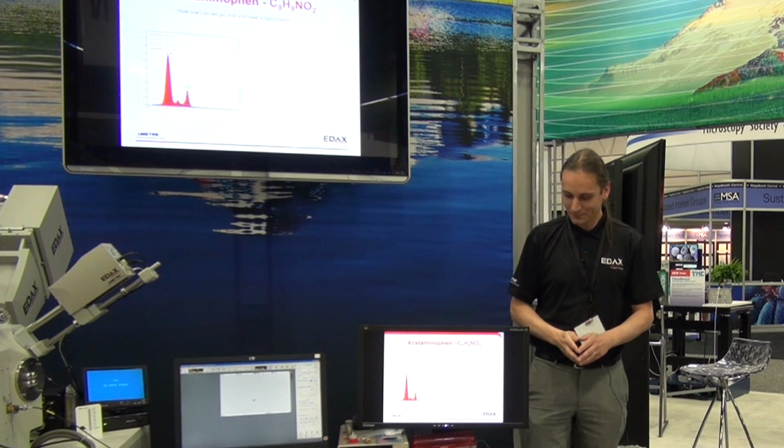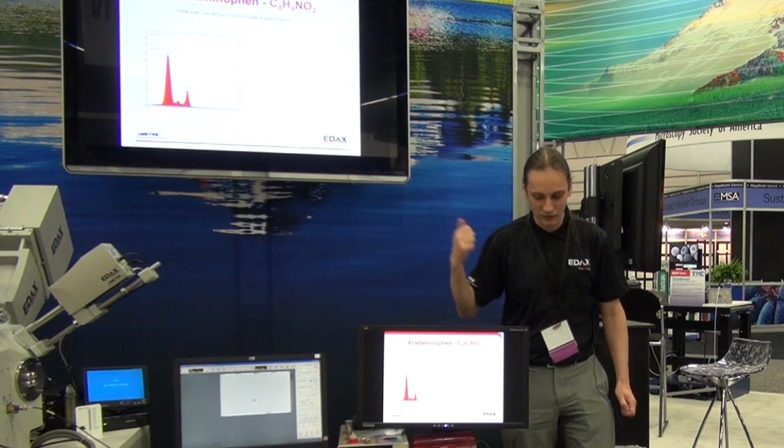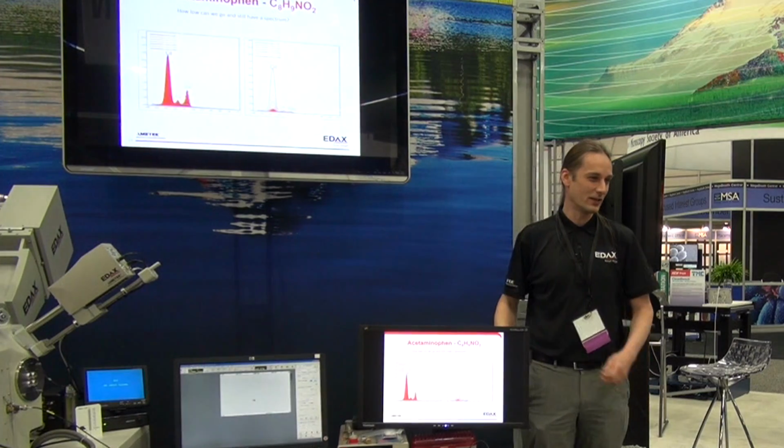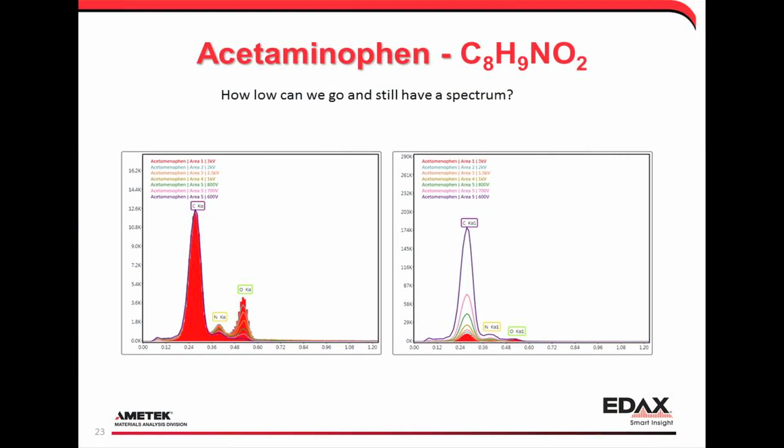Of course, the marketing approach to this is not to look at the decrease in my oxygen signal. Let's rescale it to the oxygen peak and say, let's look at the amazing increase in carbon signal instead. Depends on what you want to look at. But when you move into the low energy range, you start to get very limited in your line selections and what you can actually do.